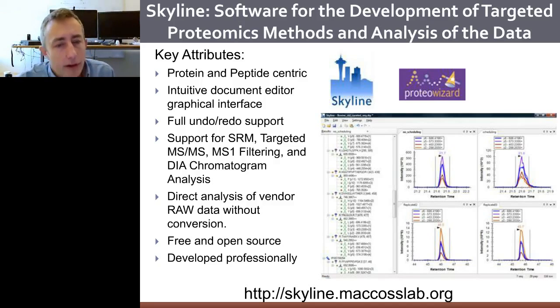There's been a lot of talk within our field about standard formats. They tend to be a little cumbersome. They're not as efficient as vendor file formats. Also, there's always some loss of information as you go from the vendor format to a standard format. So we wanted to make sure that we could read the vendor data directly without file conversion, and that was actually quite a bureaucratic hurdle to overcome because the vendors weren't, at the initial time, trying to make it easy for us to get data out of their software.